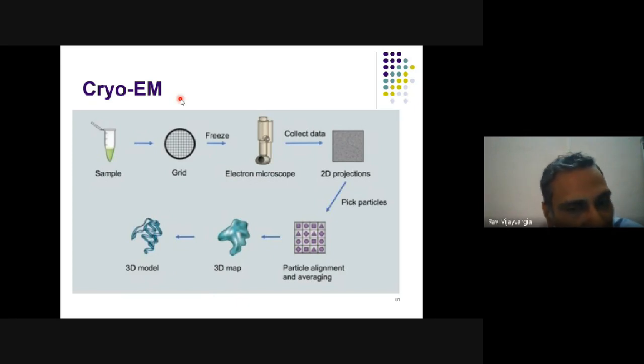In India, there is only one cryo-EM system right now. I think it is in NCBS Bangalore. It's very expensive, but slowly we might get more instruments in the country. In my postdoc work, we used cryo-EM to solve the structure of one of our proteins of interest, but that was in collaboration. I have not used the instrument myself, but we collaborated with somebody who had the instrument, and we got a structure solved.